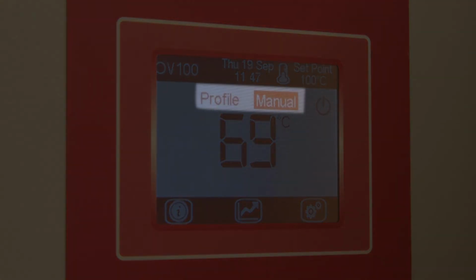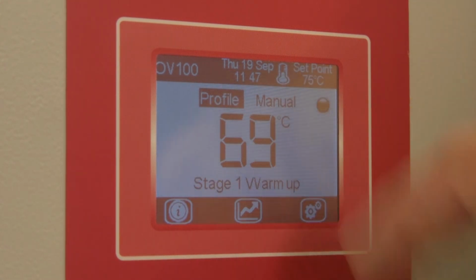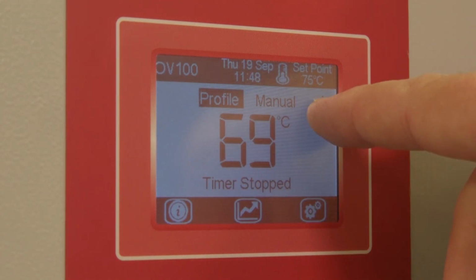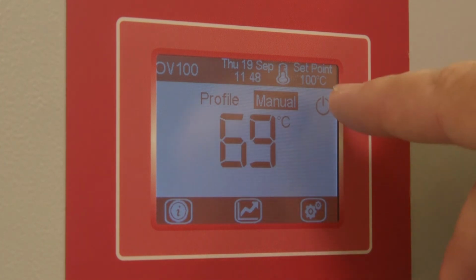You will notice now on the run screen you have a profile or manual mode. When set as manual, the oven will work in normal conditions. When set as profile mode, the oven will start to operate in profile mode and the stage is highlighted here. During profile mode, you are not allowed to change the set point of the oven until the profile is completed. However, you can press stop at any time and change the set point and run in manual mode.